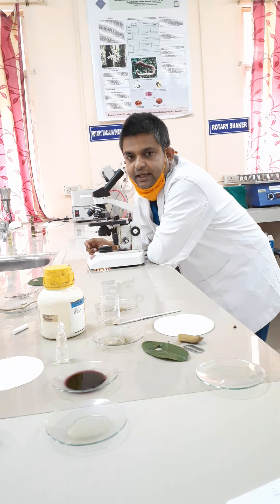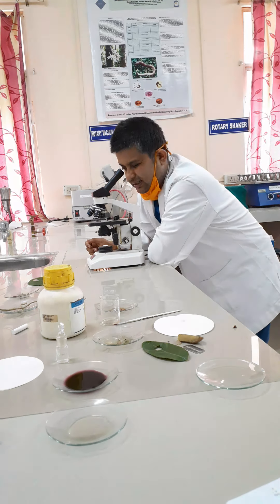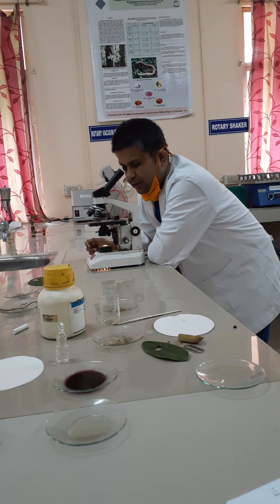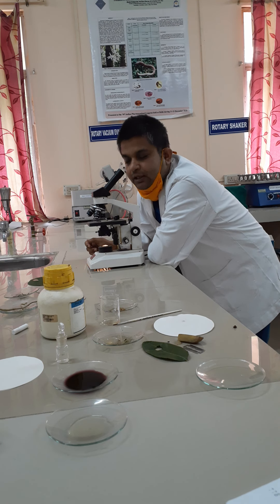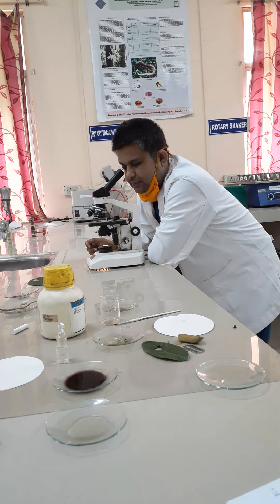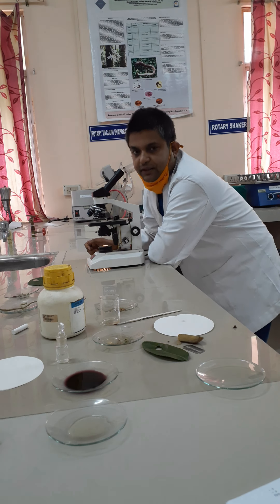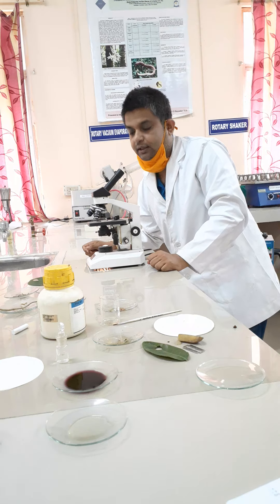So these are the various microscopical characters present in the Datura leaf. In the lamina, you will find mesophyll consisting of both palisade and spongy parenchyma, followed by the epidermal part with multicellular covering trichomes and glandular trichomes. In the midrib region, you will find collenchyma cells followed by the vascular bundle. This is the microscopical transverse section of the Datura leaf. Thank you.